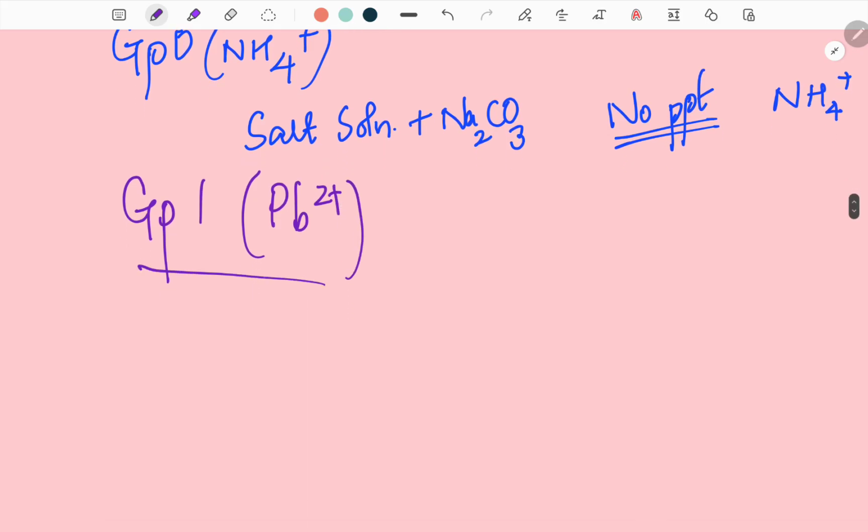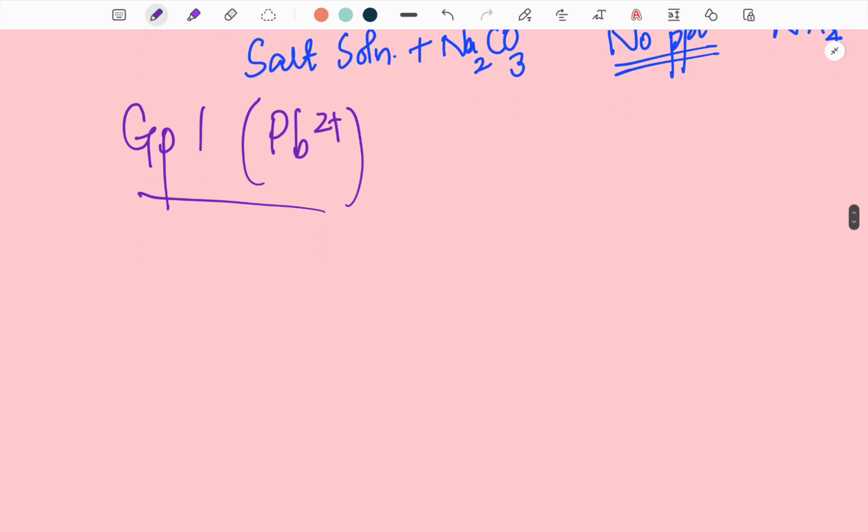Now for lead, what is the systematic or identification test? You have to take the salt solution. Again, I told you we are using the salt solution, and you need to add dilute HCl.